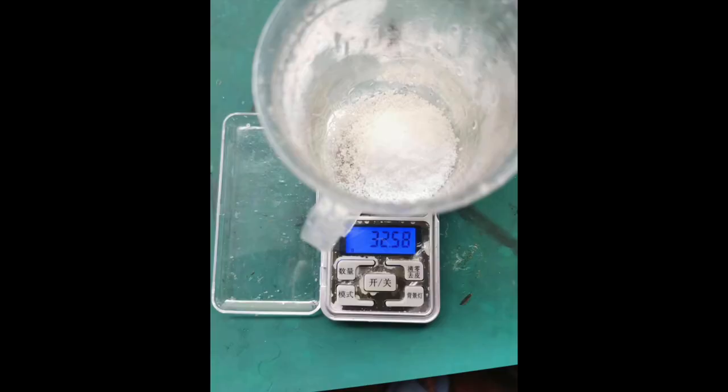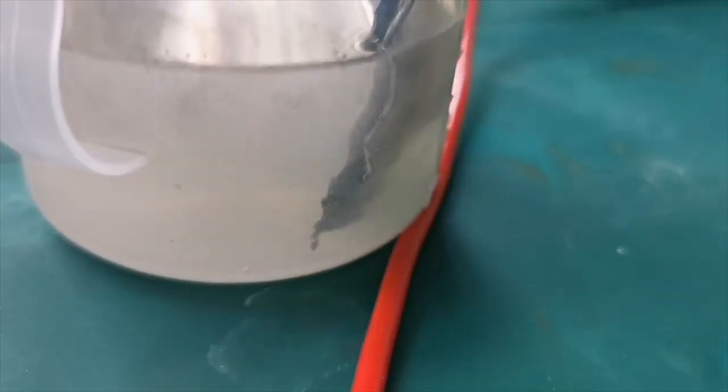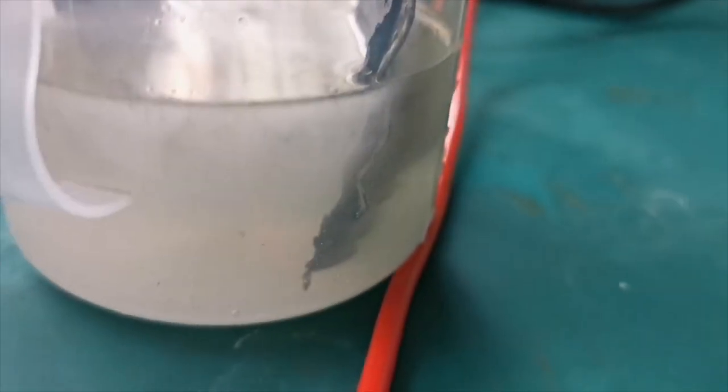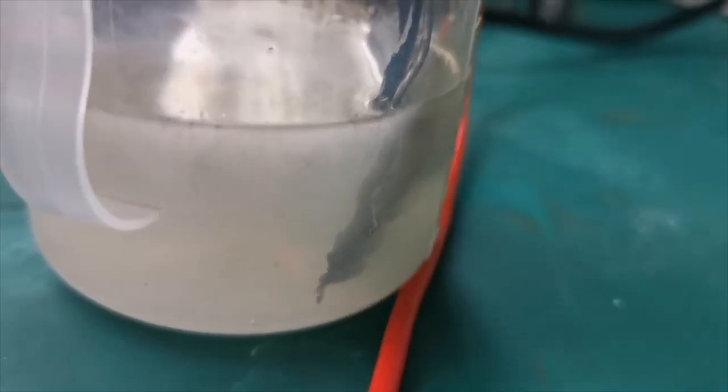Our electrolyte is going to be a solution of sodium hydroxide. I measured out about 32 grams of sodium hydroxide and dissolved it in about 100 milliliters of water. The exact quantity doesn't need to be exact, but we want the concentration of the sodium hydroxide solution to be at least 20%.